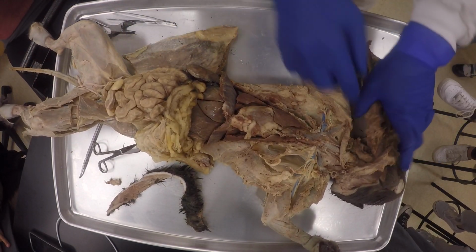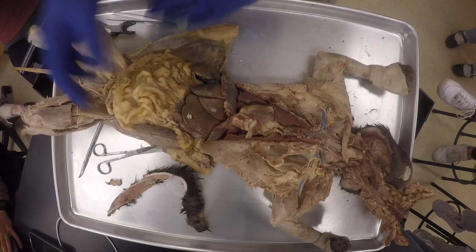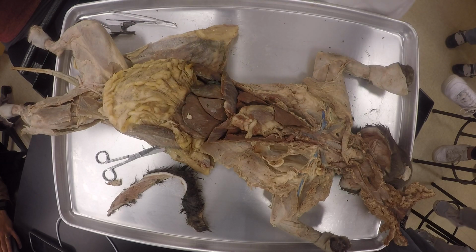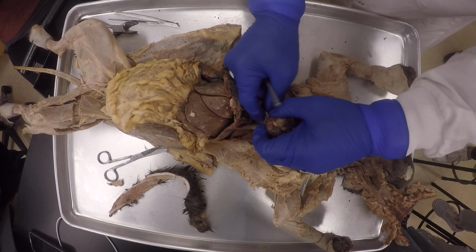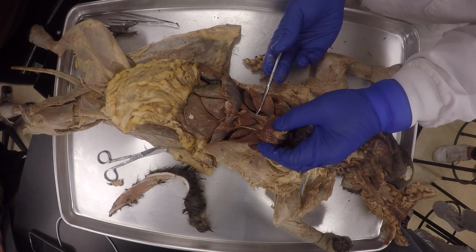Okay, my good friends, now that I have focused a little bit on the circulatory system, I'm going to focus on the business end of today. So now I'm really going to do the respiratory system, and I'm going to finish exposing the inferior vena cava, and this is the phrenic nerve.